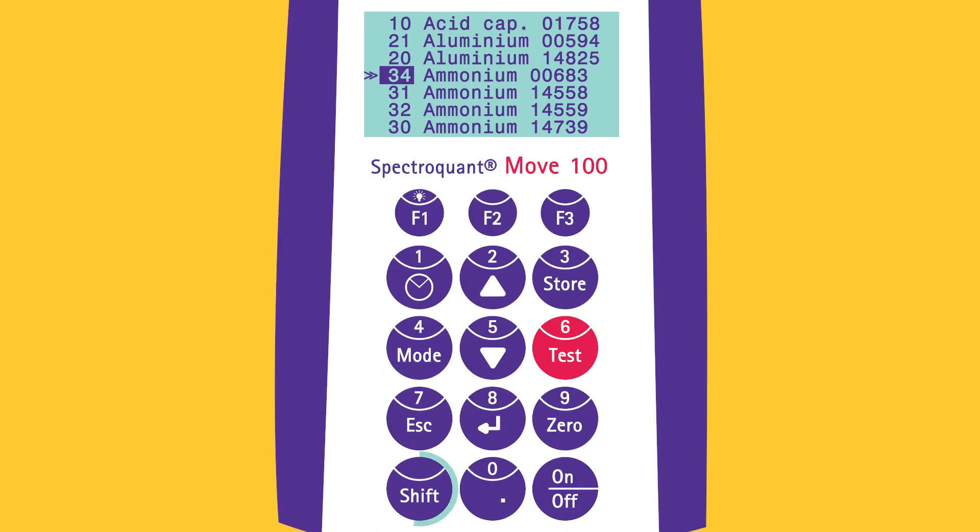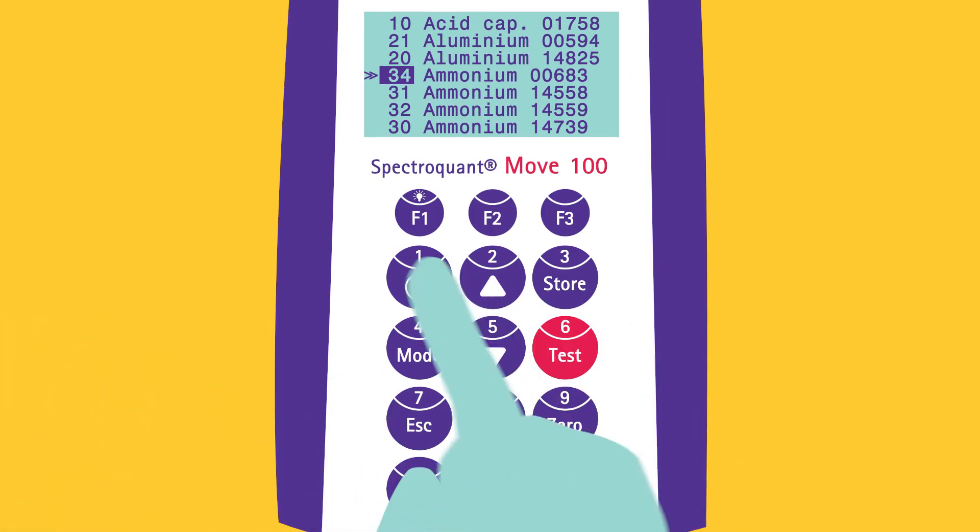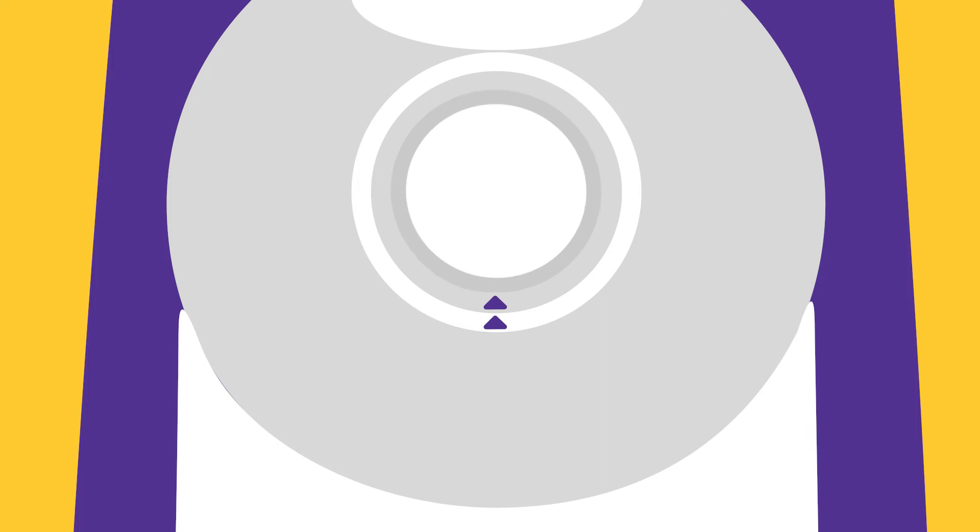Press and hold SHIFT to enter the number. If 16mm cells are used, an adapter is necessary. While placing the adapter, remember to align the small triangles of the instrument and adapter. When using 24mm cells, an adapter is not necessary.